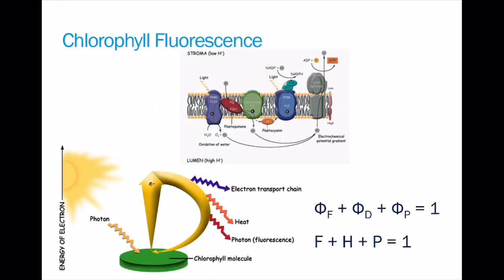Now let's talk about chlorophyll fluorescence. Again, as a reminder, with fluorescence, we're really assessing the light reactions of photosynthesis, which we know work in concert with the light-independent reactions. So even though we're measuring mainly the light reactions with fluorescence, because those systems work in concert with each other, we really can get a pretty good idea of how the whole system is functioning.